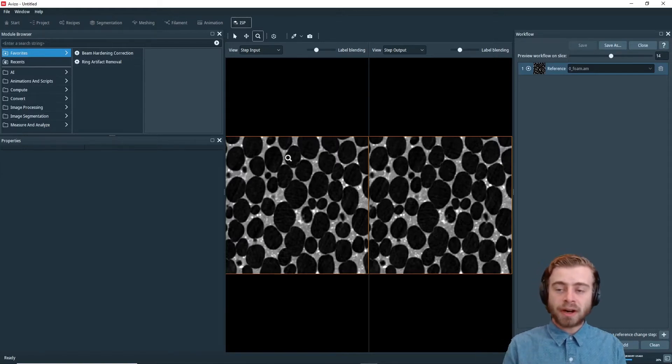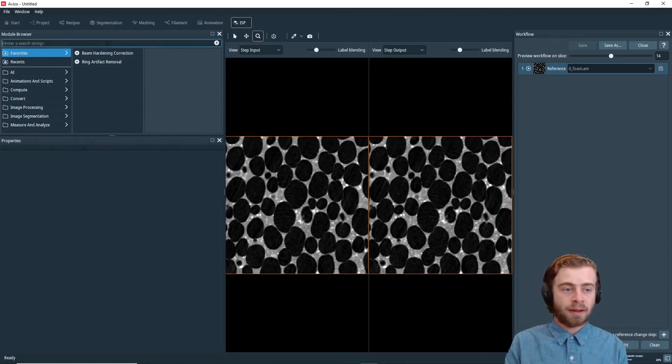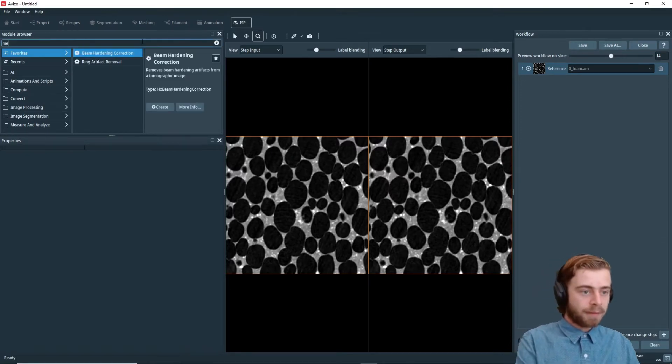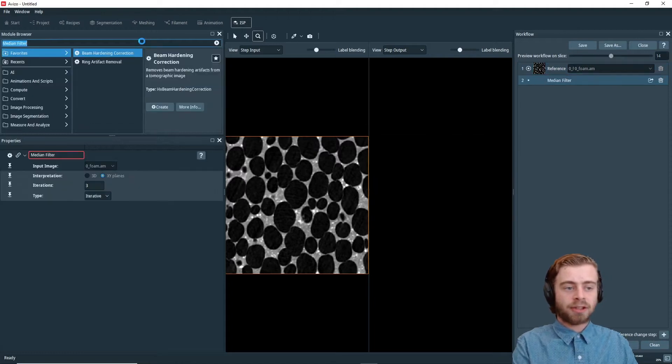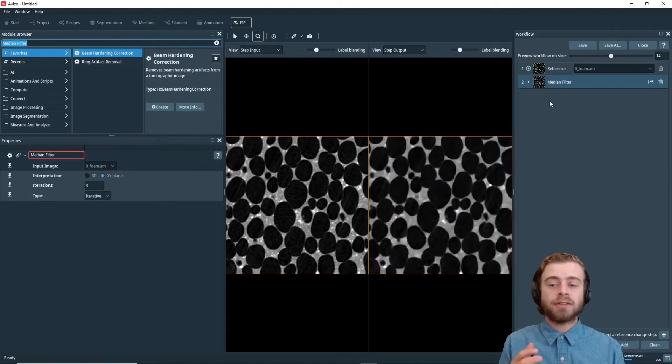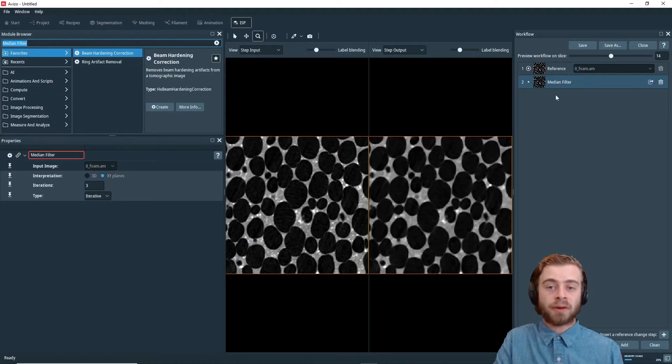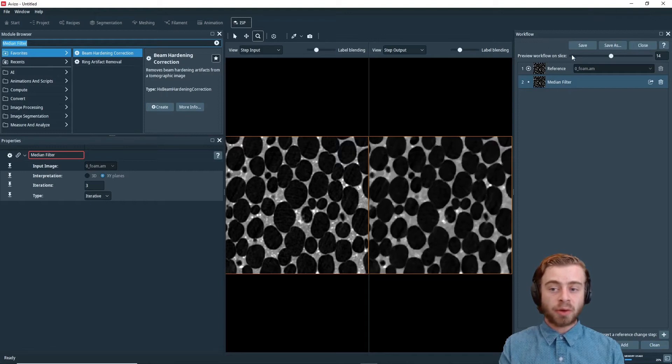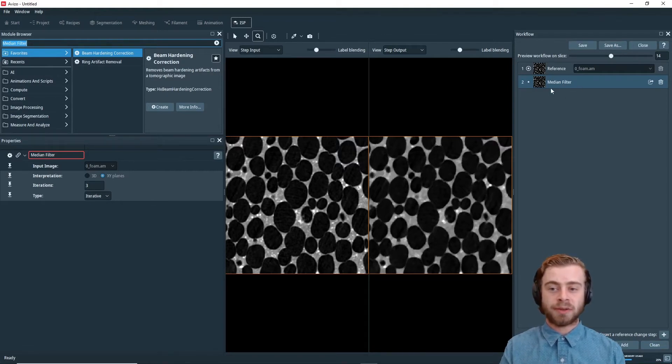So to start out, I'm first just going to add a median filter in. I'm going to search Median Filter and click Enter. So first thing I want you to notice is now there's a median filter in our workflow window. The first thing it does is it loads the image in with this reference step, and then it applies a median filter to it.